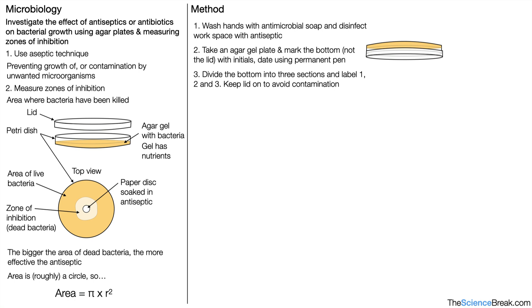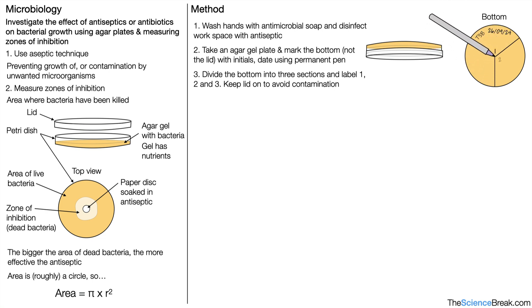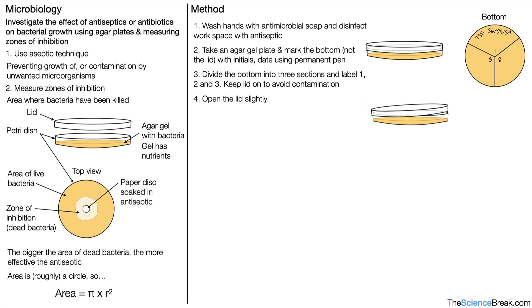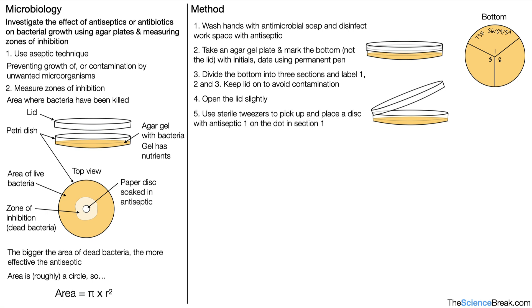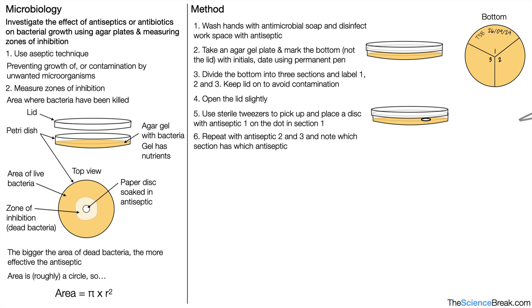We keep the lid on to avoid contamination by unwanted microorganisms. Looking at the bottom of our plate, we use a permanent marker to divide it up and label it with a date and initials, divided into three sections labelled 1, 2, and 3 because we are testing three antibiotics or disinfectants. We then turn the dish the right way up, open the lid slightly — as little as possible — and use sterile tweezers to pick up a paper disc soaked in antiseptic 1 and place it on the dot in section 1. We then close the lid as quickly as possible.